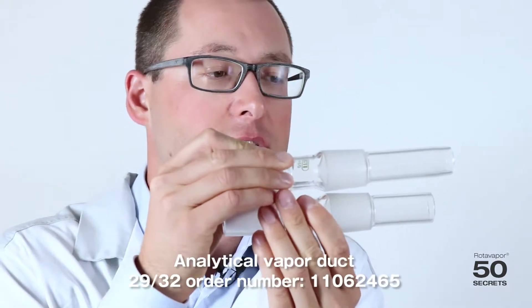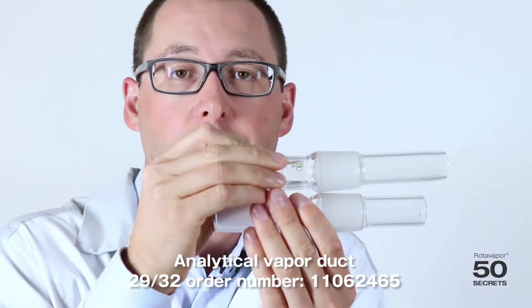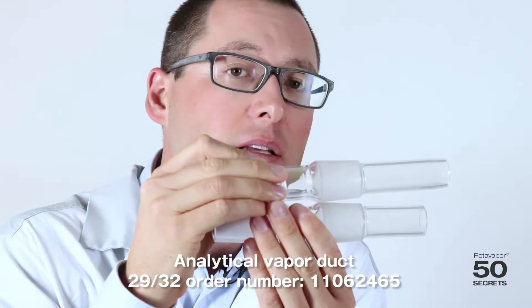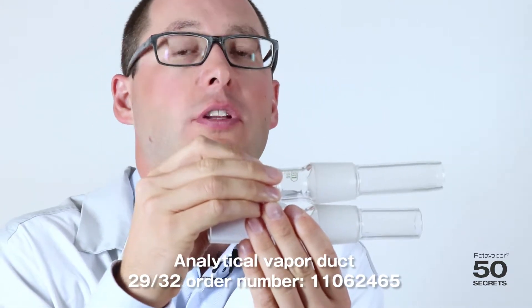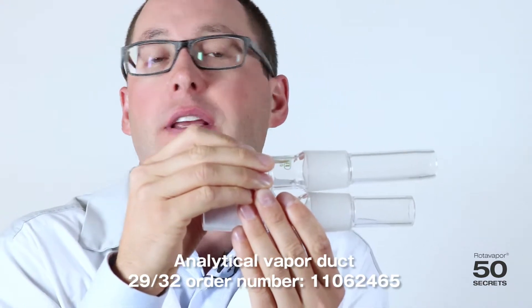The first vapour duct I would like to show is the analytical one. The big difference is it is slightly longer. Analytical means there should not be any solvent flowing back into the evaporating flask. That's why it's slightly longer, so that even if we have solvent on the seal, we don't have any solvent going back into the evaporating flask.